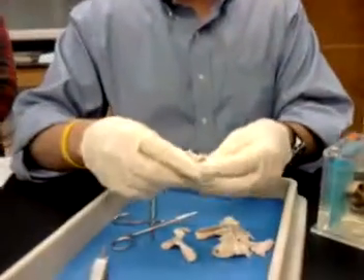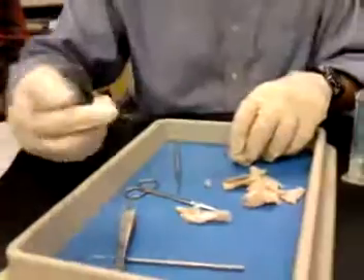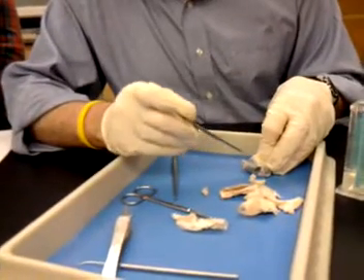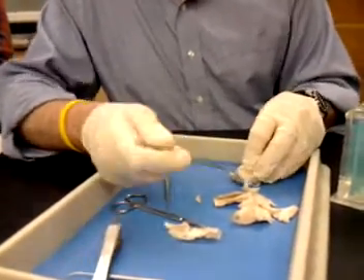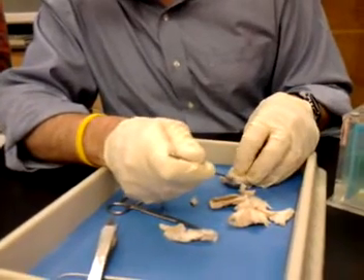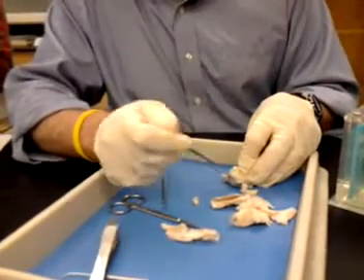Now, the way you're going to cut into this is you're going to kind of lay this down like this. You're just going to take the scalpel about a quarter of an inch from where the cornea is. You'll see a little bit of liquid coming out, and that's going to be part of that humor.